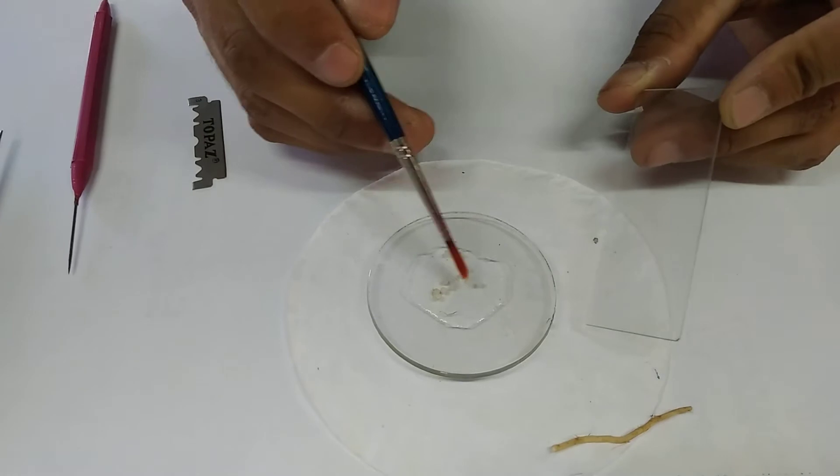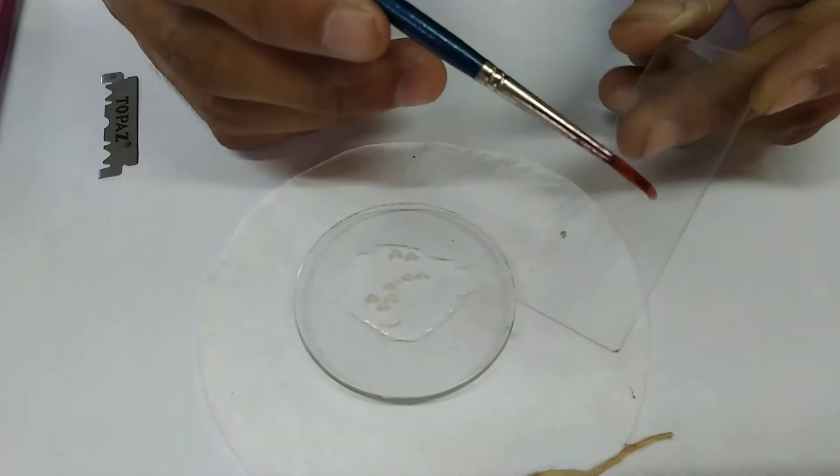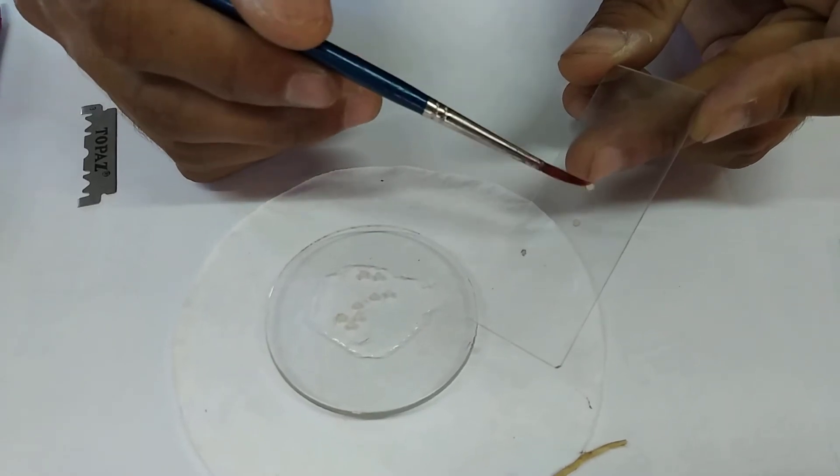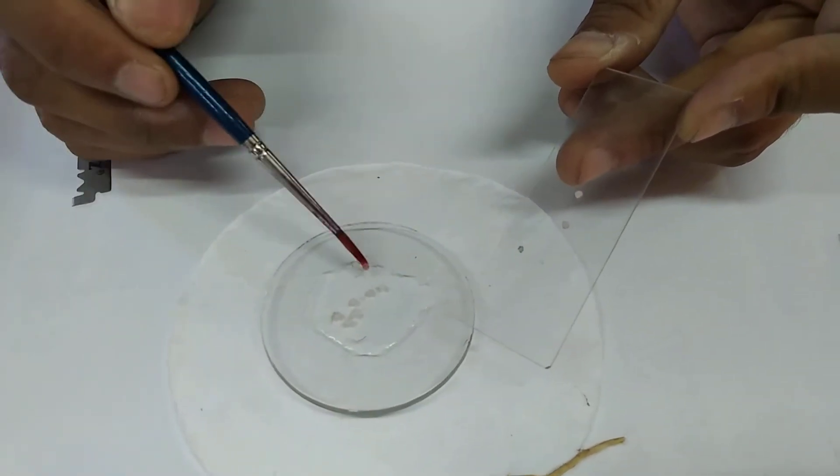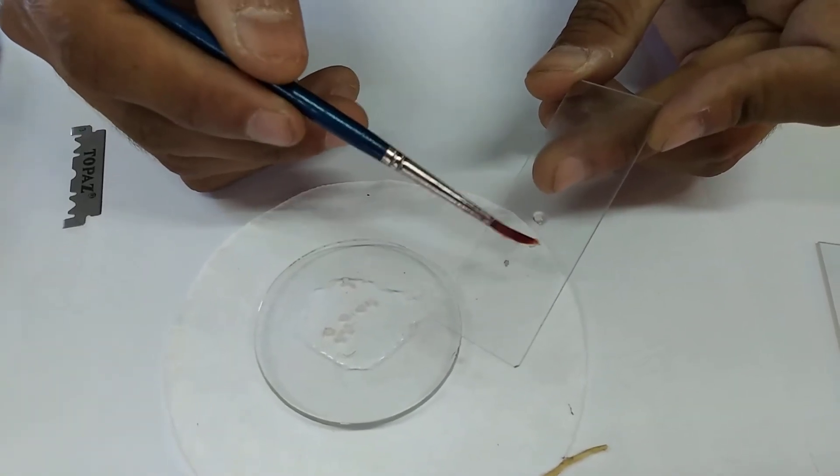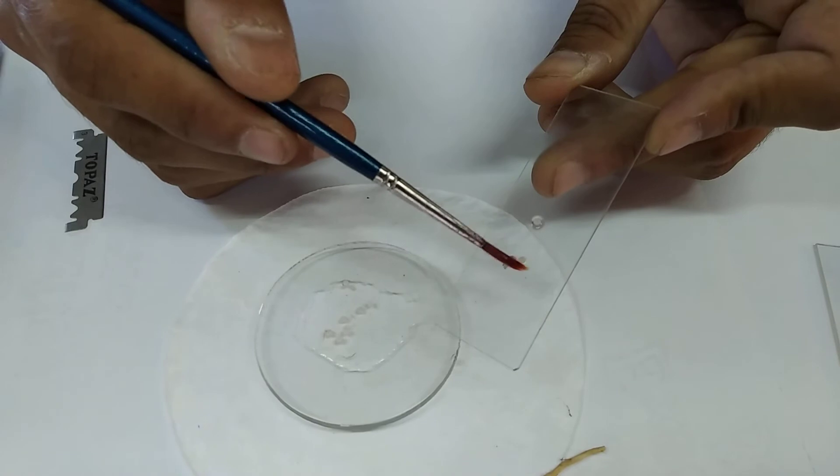After cutting many sections, select the thinnest one and with the help of a brush transfer it to a glass slide. Take two to three sections and make sure the sections you select are very thin.